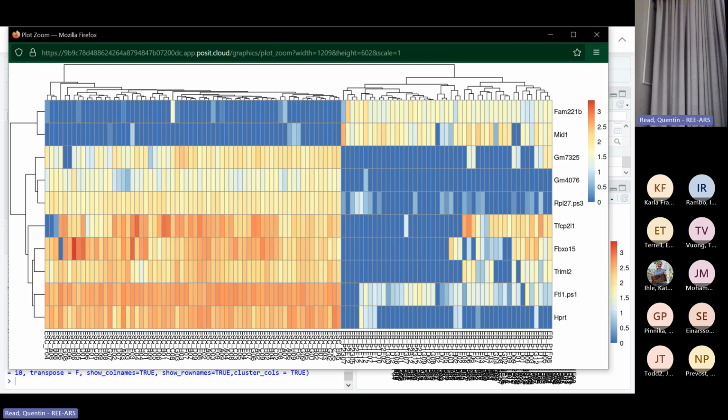So even though the model did not know anything about the groups, the factors explaining the most variation are actually associated with those groups. So it seems like the groups truly are different in some meaningful way in terms of gene expression. Not surprising because they're 2 different kinds of cells, so it would be weird if they weren't, right? But they are, and that's nice.